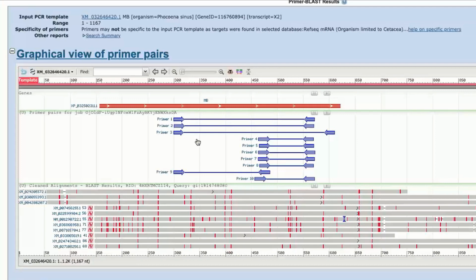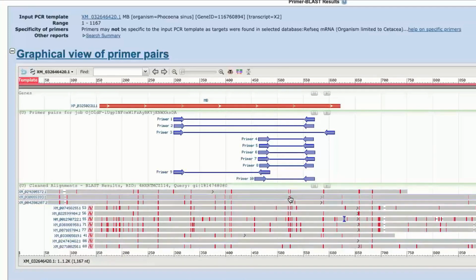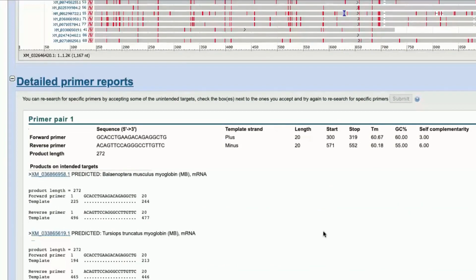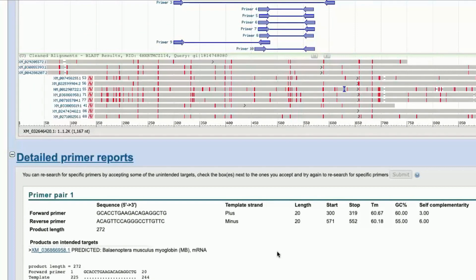If you look at a lot of these sequences compared to each other, you'll notice that they are different just in certain areas. You can kind of see these red spots here. So maybe you only care about protein changes that happen in this particular region. So you'd want to pick maybe primer set 9, or maybe you care about gene changes over here in this particular region. You'd pick one of these primer sets, right? And then down below, things like melt and statistics have a lot to do with how you run the PCR and your thermocycler. So all the details are down here so that you can get the best result when you actually use one of these primers as a template.